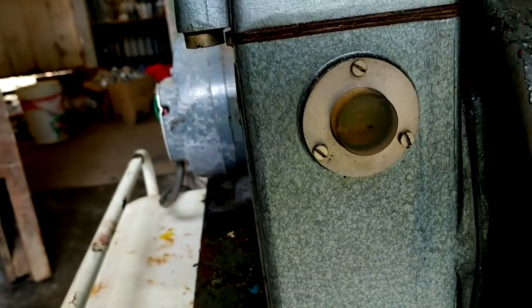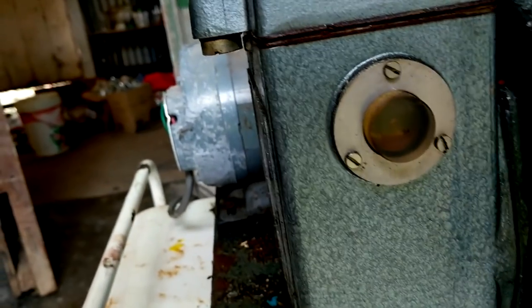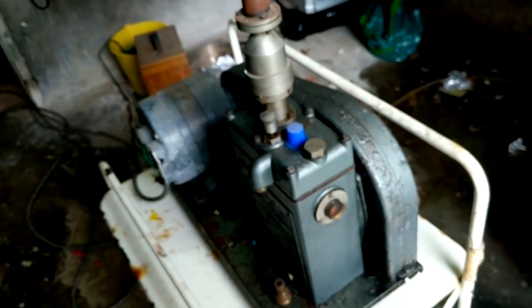Looking at the oil level through this little window it looks pretty low — I don't actually know what it's meant to be but I reckon it looks low. It also doesn't look very nice; it's a bit discoloured. I think it was always a yellowy colour but it looks off, so that's no good.